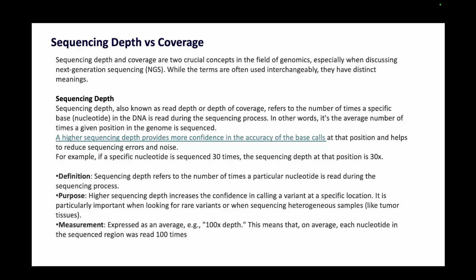There also, how many reads does this variant support? That is a question that is often asked, and if the number is higher, obviously you have high confidence in the particular variant existing. If the number of reads is lower, then obviously you have low confidence.